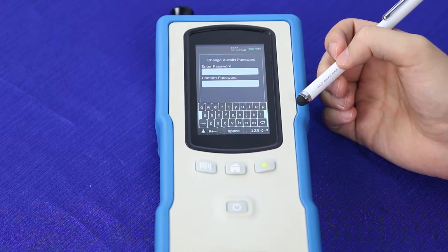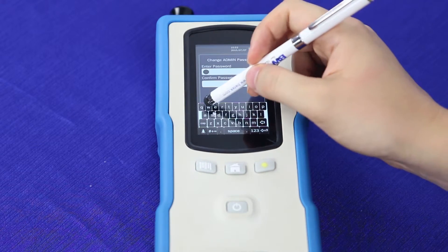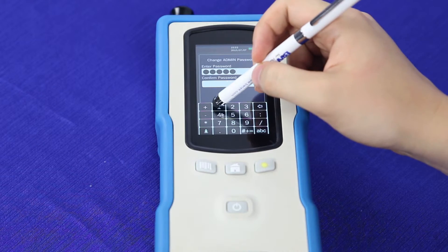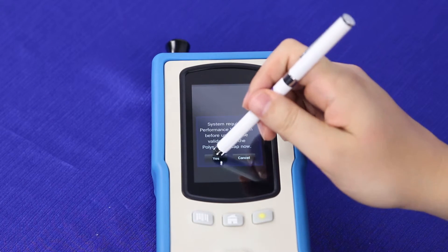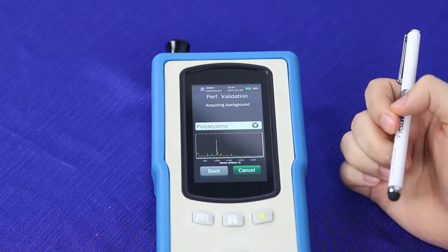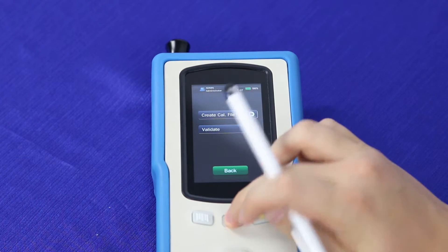It will then ask you to change your password. Passwords can be 6 to 20 characters long and can be either numbers or letters — in this case, we're going to put in BWTEK1. As soon as you've changed your password, it will ask you to perform a performance validation. Since we already have the polystyrene cap in, we press yes and then validate. As soon as it passes, this opens your system up and allows you to begin use. Press done and go to the home screen.